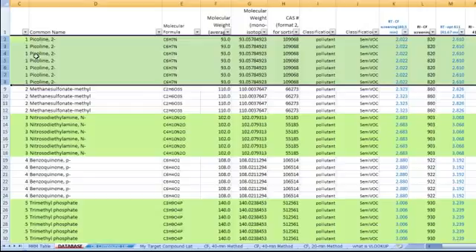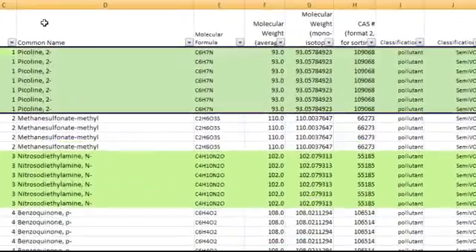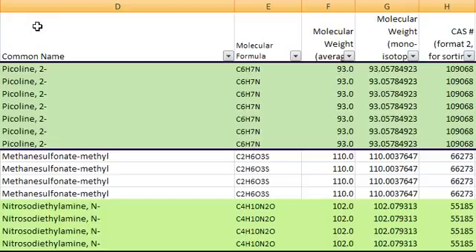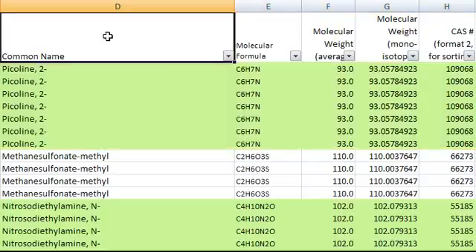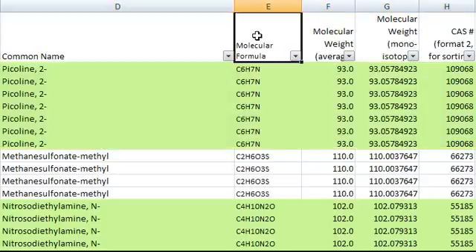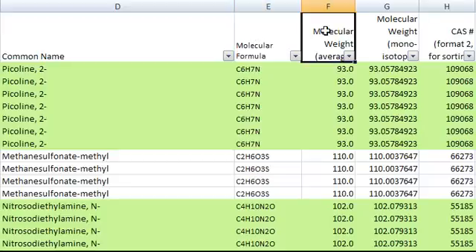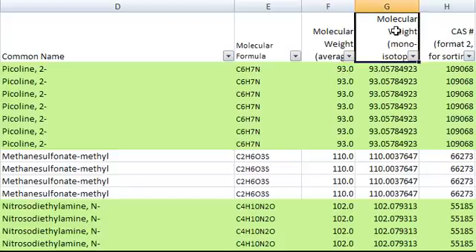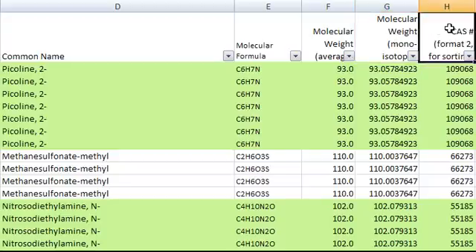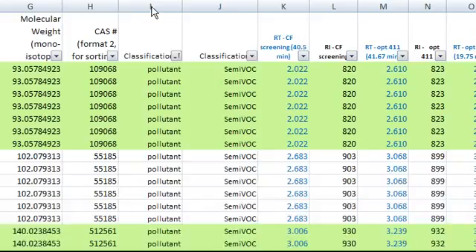Let's go over the different columns in the database tab. The first one is the common name of each compound. Next column is the molecular formula. The next one is average molecular weight. Next is the monoisotopic or exact molecular weight. The next column is the CAS number. This CAS number column does not have dashes for sorting purpose.